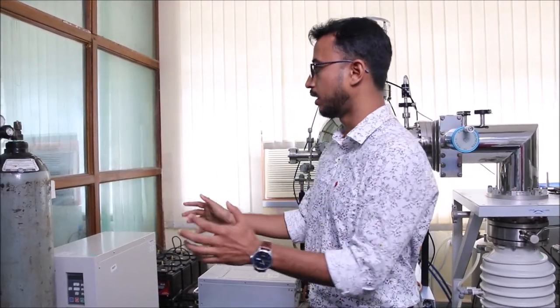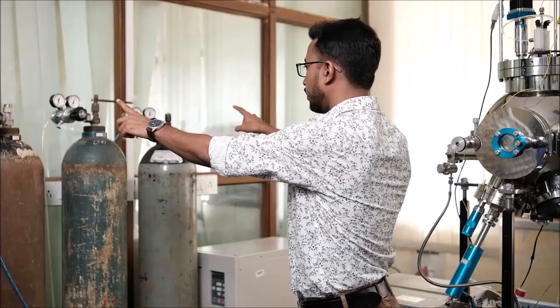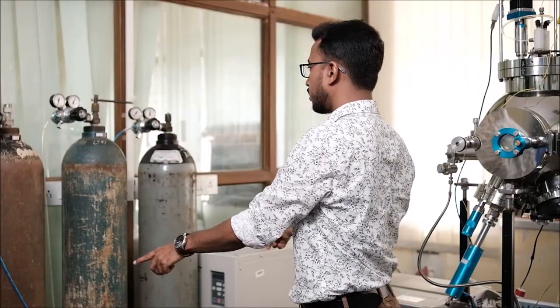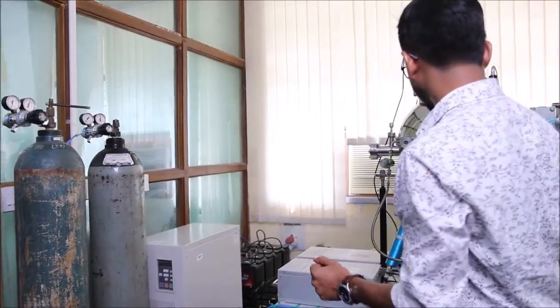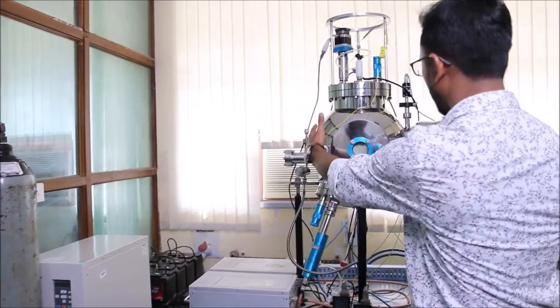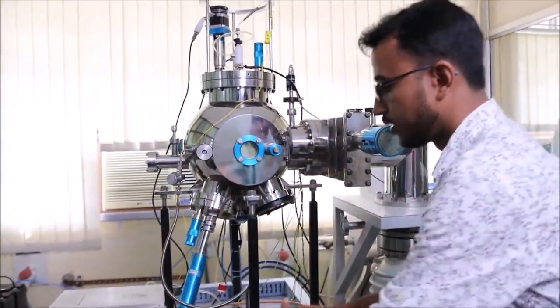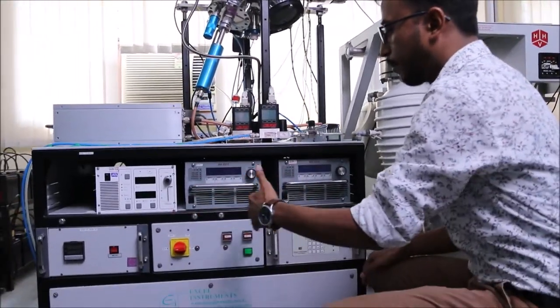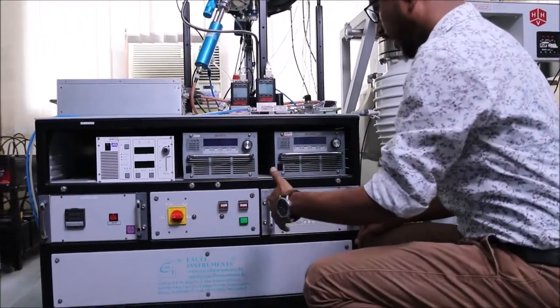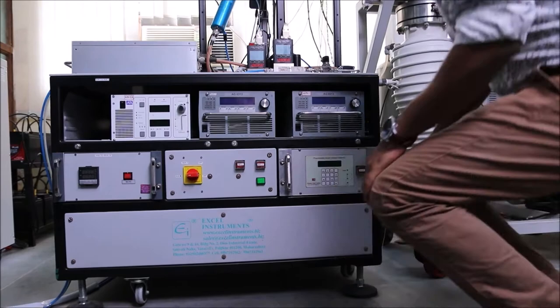Broadly, there is the gas unit part, which consists of three gases: argon, oxygen, and nitrogen. Then this is our sputter system where the actual deposition occurs. This is the controlling unit, where the power, temperature, and rotation controller unit are located.